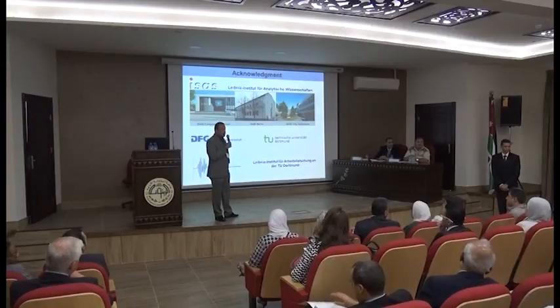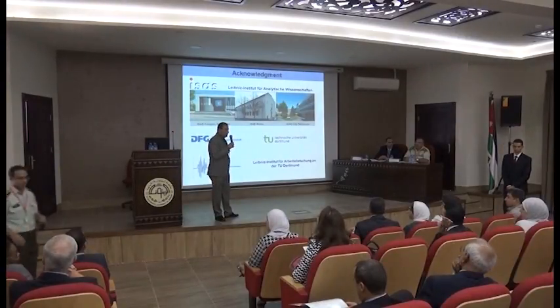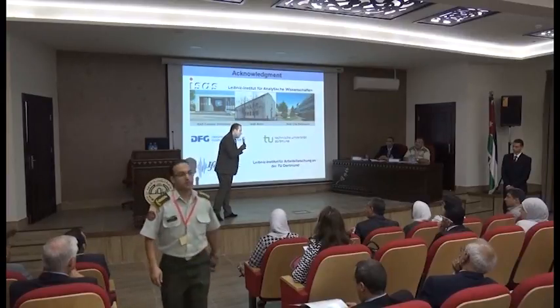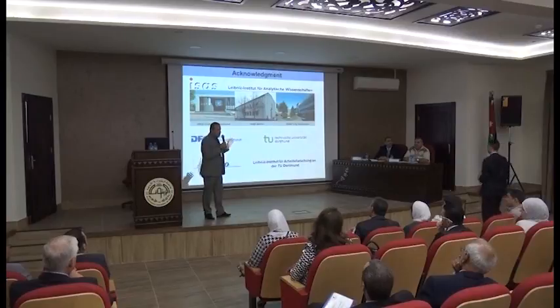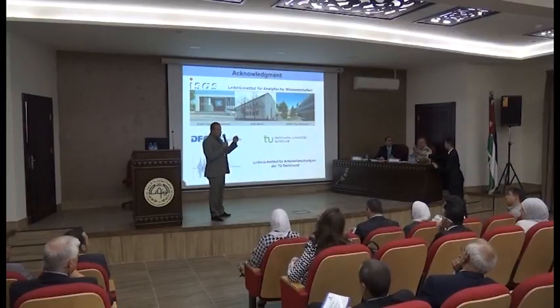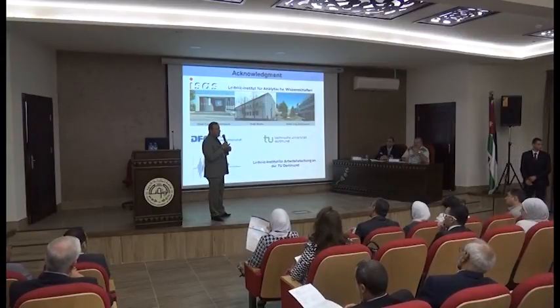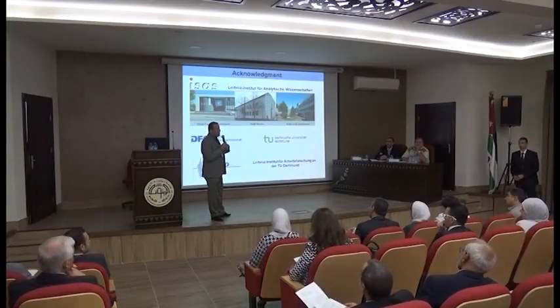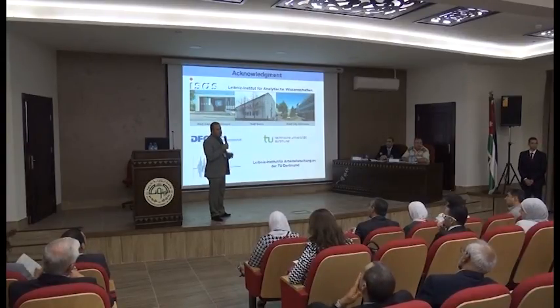And do you have any sort of standards to make sure that these are the right metabolites? Do you use purified glucose or purified lactate to make sure that these peaks are the correct ones? Yes, we have several measurements for control first. We have several measurements for control and for comparison before we start. We start with the standard media, and then we have the media alone without cells for 72 hours, and after that we have the control measurement and then the real measurement.